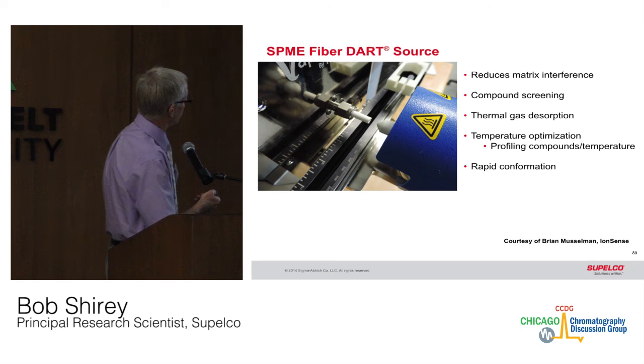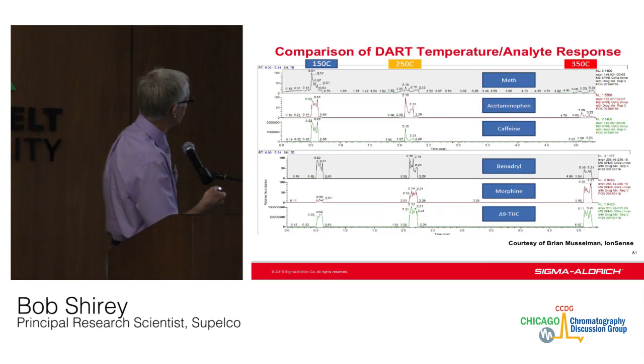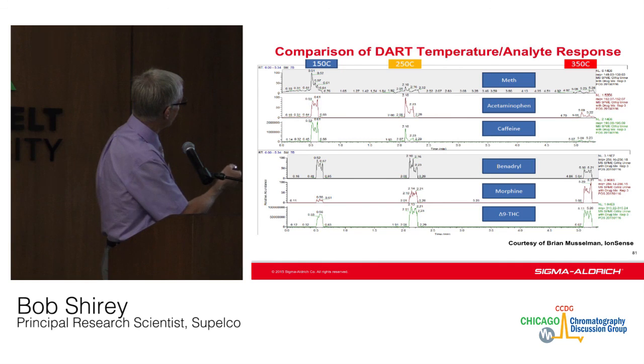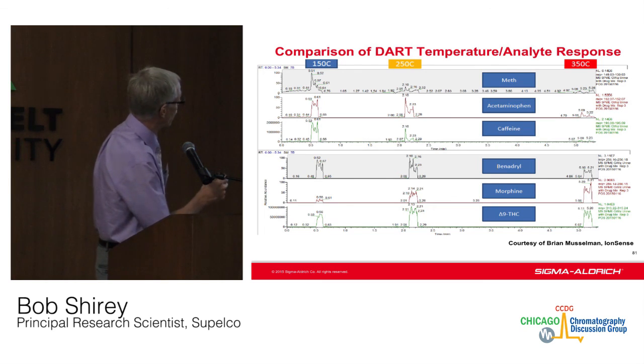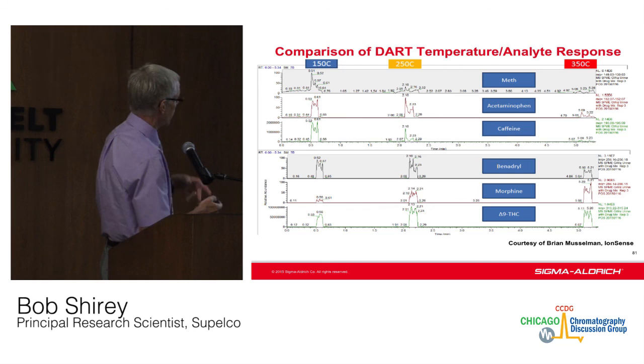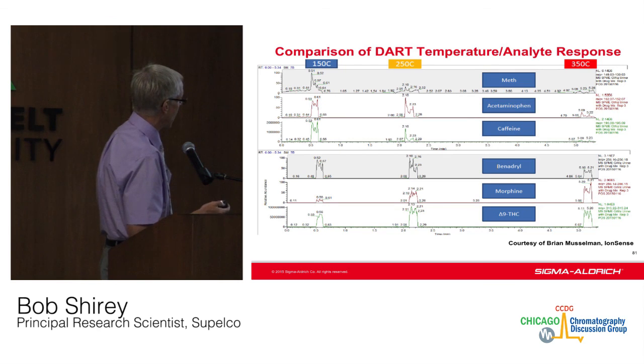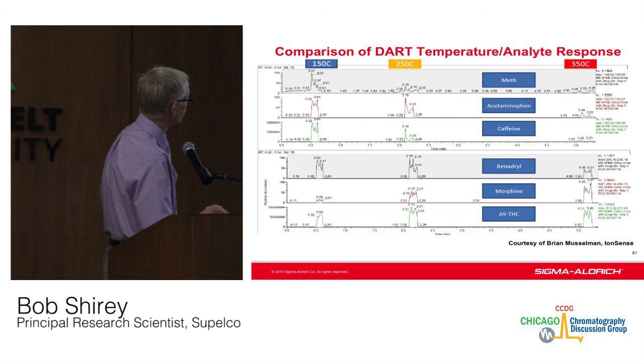The other way to do it is with a DART, which uses thermally heated gas, and then it's directly interfaced into the mass spec. In this case, you vary the temperature of the gas going over the fiber, and depending on the compound, you find out the temperature that is best. But again, all these techniques on these direct interfaces are when you're looking for known compounds or for a series of compounds that you're scanning for, because direct exact mass is a requirement for the analysis.